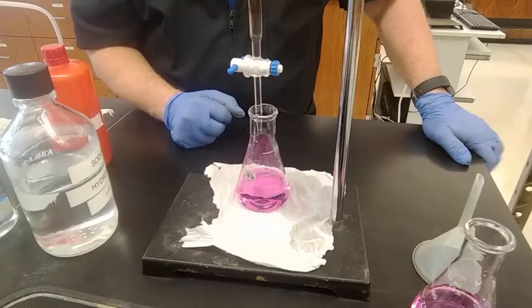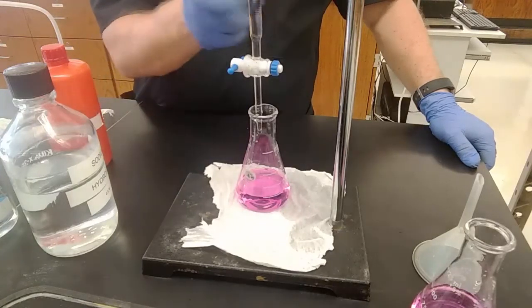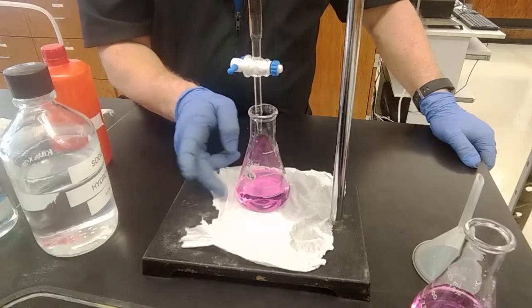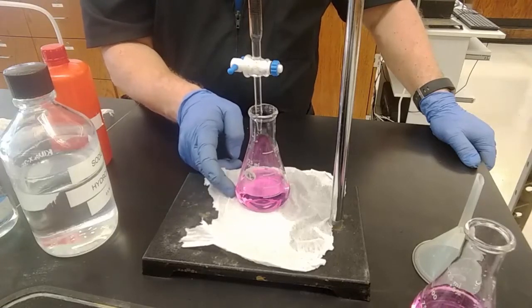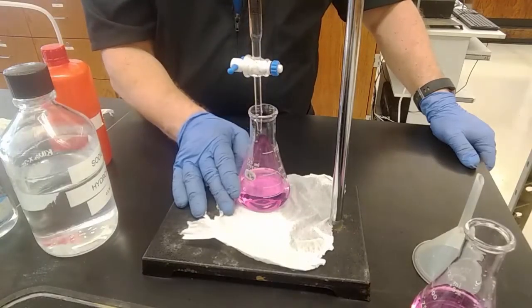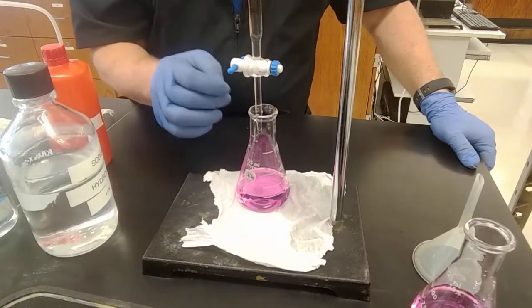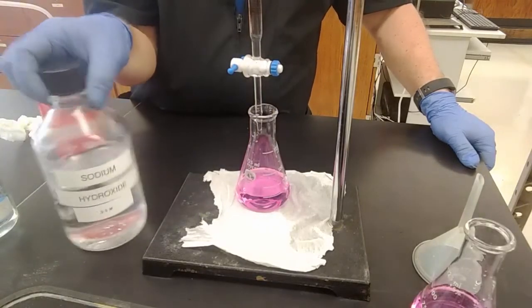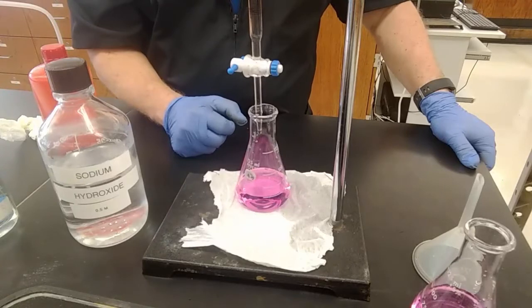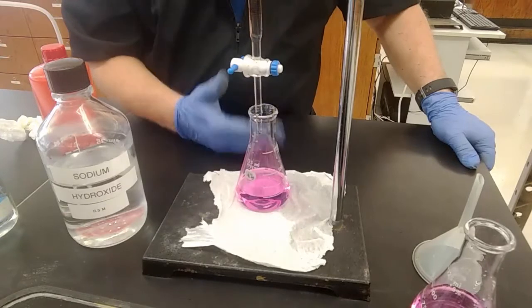Now this is going to require some additional discussion, perhaps with your instructor. But if I have too much base added, then it would appear that there's more acid in here that it reacted with, right? Let's use round numbers: 20 milliliters of base to react with the acid. But I added extra, I missed it. It was only supposed to be 19. Well, the molarity of this base is 0.5 molar, right? Molarity, 0.5 molar, times the 20 milliliters is going to give me a certain number of moles, versus the molarity times 19 milliliters that it should have been, which is going to be a lesser number of moles.